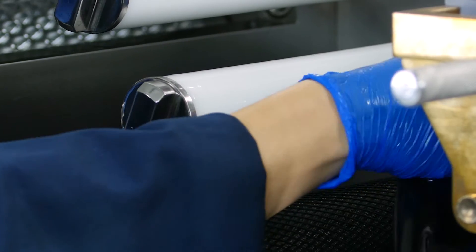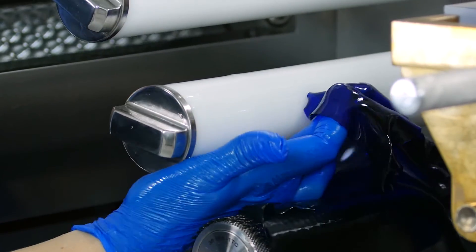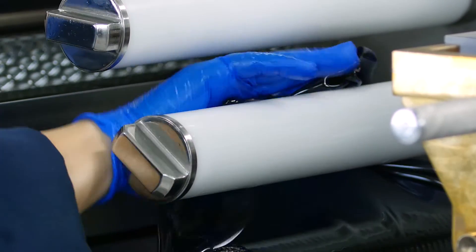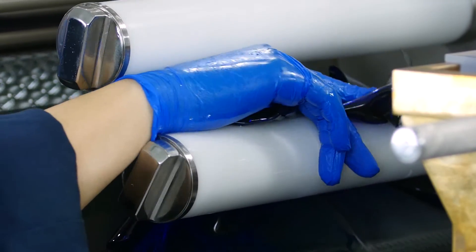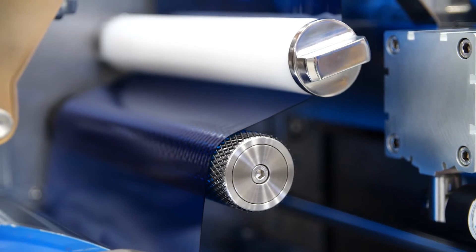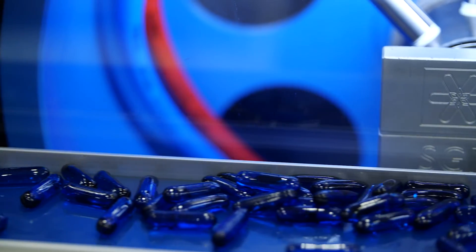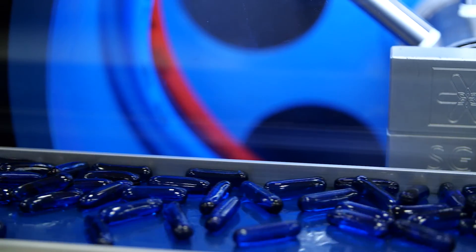The gelatin ribbons are peeled off the casting drum and fed through a pair of porous oil rolls, where lubricant is applied to both the upper and lower surfaces of the ribbons. This ensures that the gelatin will not stick to the machinery and that the final capsules will not stick together during the drying process.